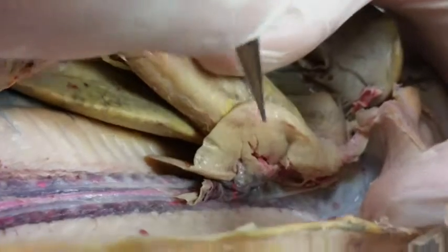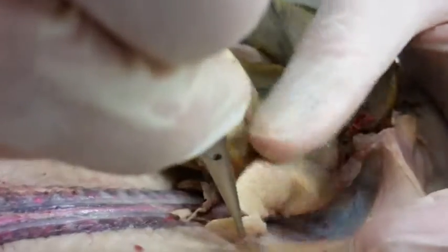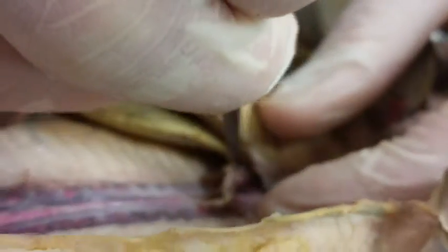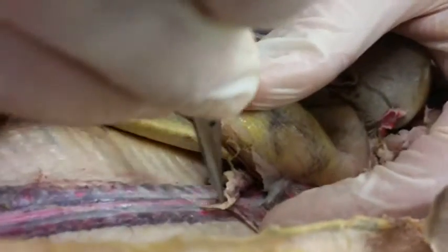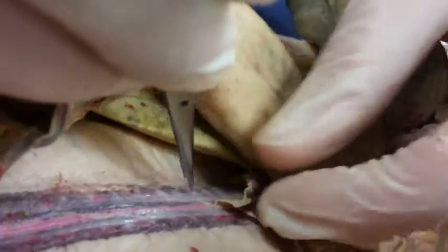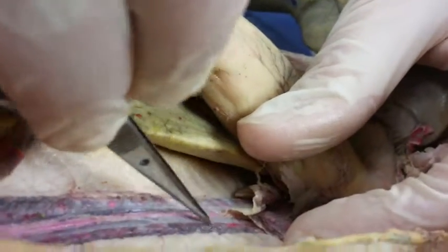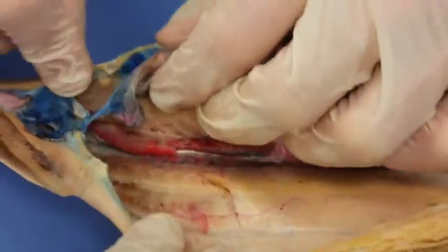Then, leading down next to the ovary is going to be the mesovarium, which you can kind of see right there. It's very, very delicate. Then leading down, we'll have the oviduct, which is running not very far away from the dorsal aorta, but runs all the way down. And down. And down.